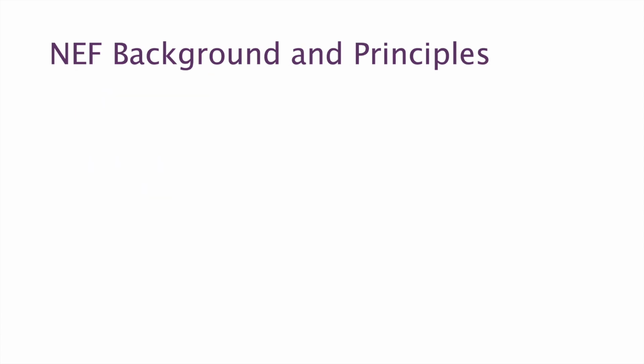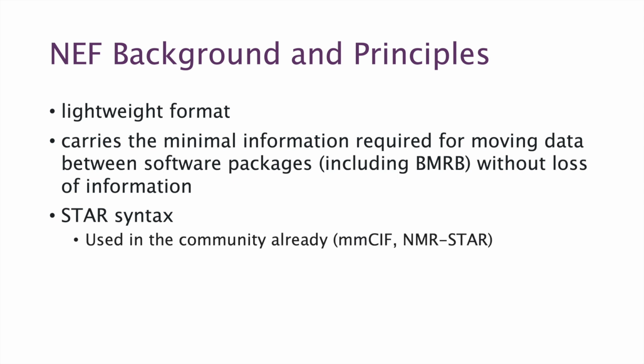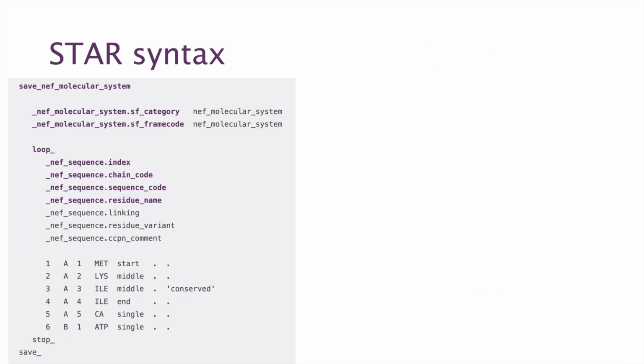The NMR Exchange Format was always conceived as a lightweight format, which would place a minimal burden on software developers. This means that it carries only the minimal information that is required for moving data between software packages, or in and out of the BMRB, without loss of information. It is important to get this balance right. The star syntax was chosen since this is already used widely in the structural biology community, it is humanly readable, and it is easily extendable with program-specific namespaces.